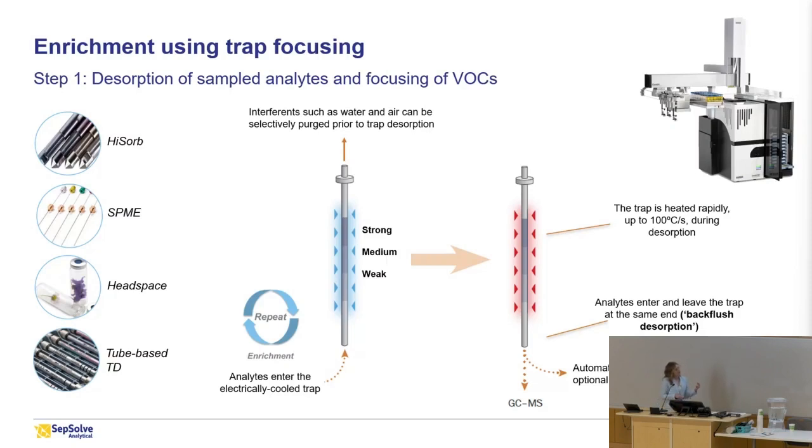Additionally, we can do an automated recollection before it goes to the GC. If you're thinking about food samples that can potentially go bad, this is a good way to capture them onto the TD tube and preserve those samples. That also works with anything that you have a very limited amount of and can do only so many injections. You can just preserve that for months.